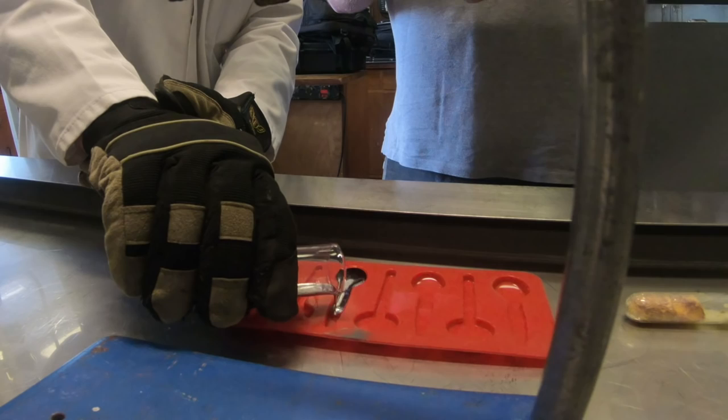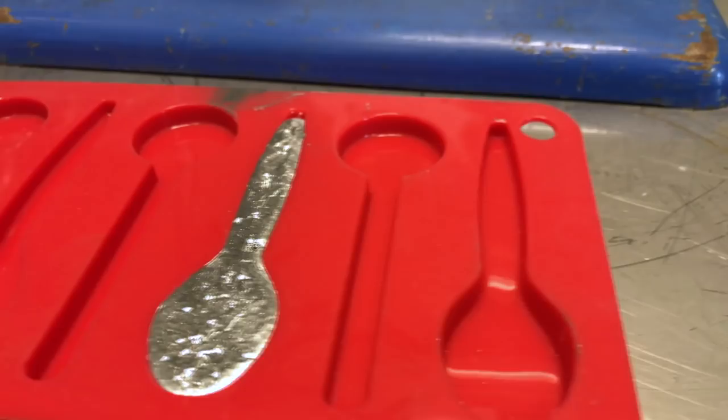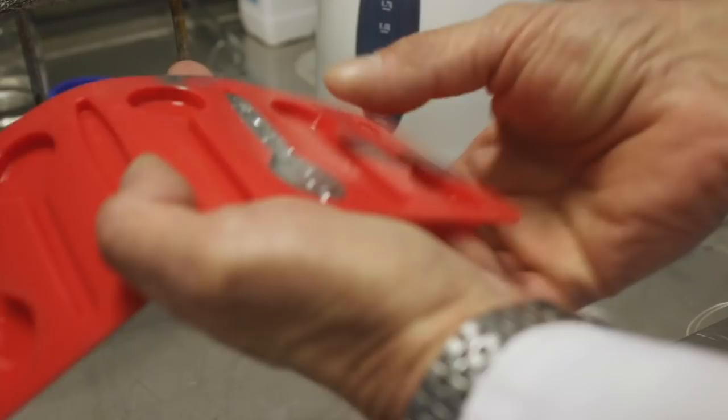One of our viewers sent us a low melting point alloy. I went out and bought Neil a mould for making spoons — it's actually meant for chocolate, but it worked for this metal. Then there were all sorts of delays, and yesterday we finally decided we should do the experiment.